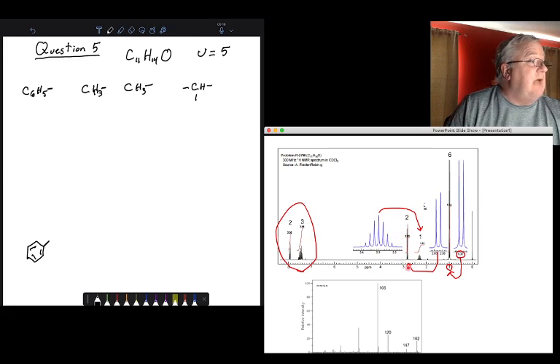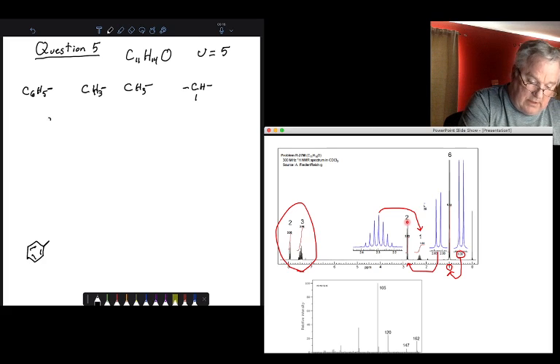And I have this thing out here at 2.85. That's a doublet that integrates for two. So the other fragment I'm going to be thinking about is a CH2 group. If I take a look, I've accounted for six, seven, eight, nine, ten carbons and five, six, seven, eight, nine, ten, eleven, twelve, thirteen, fourteen hydrogens. So I've accounted for all of my hydrogens, but I'm missing a carbon. I'm missing a carbon and an oxygen.